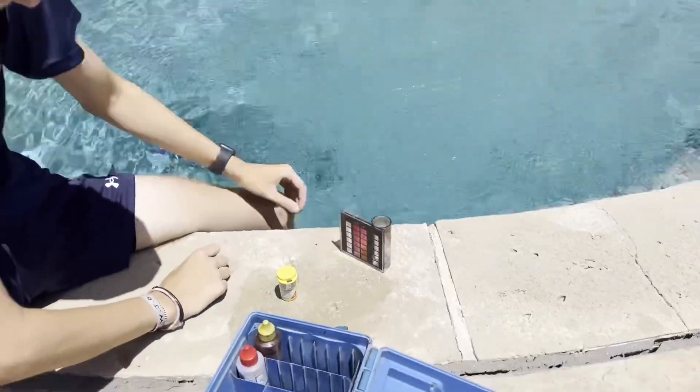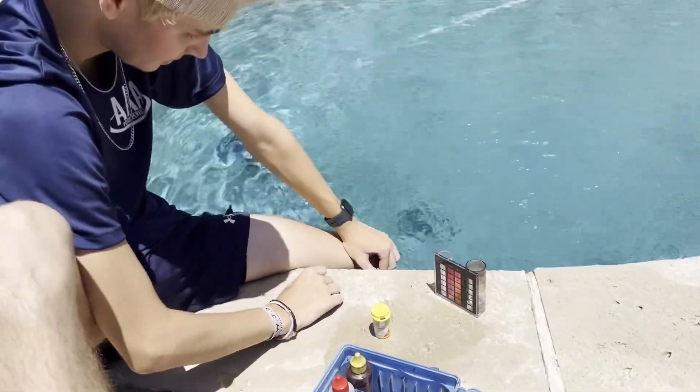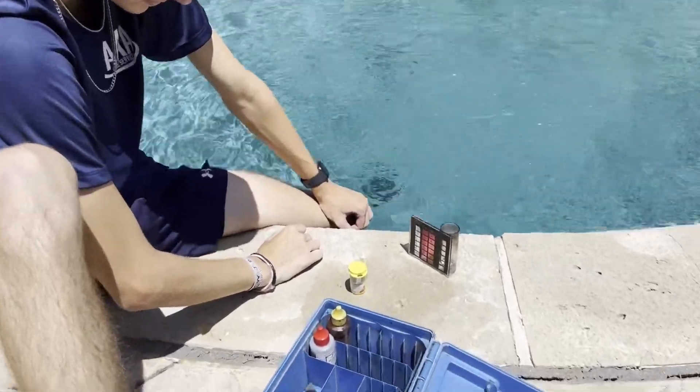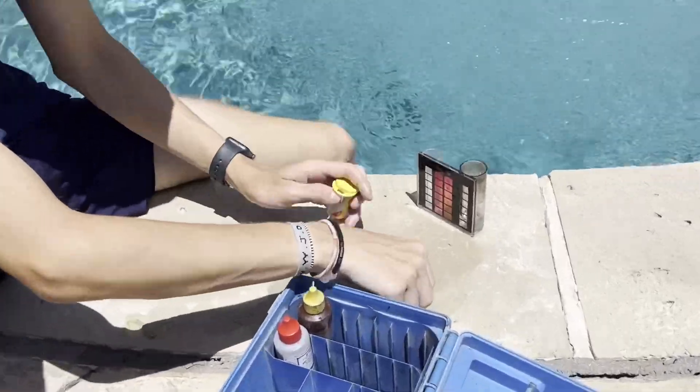Welcome back. Today we're going to show you how to test your pool water with a DPD test kit. People ask all the time what's the best way to check for chlorine in their swimming pool, and this is the absolute best. We're going to use DPD powder and let me show you how easy it is.